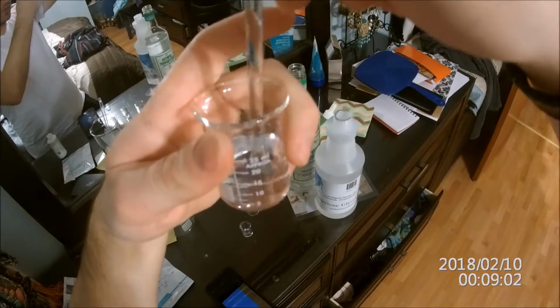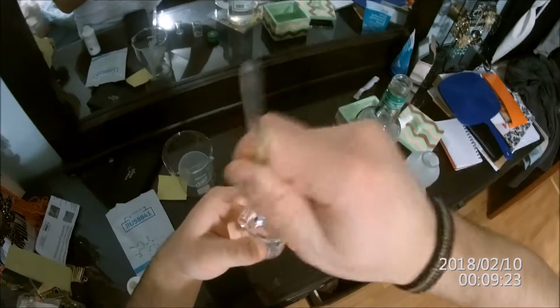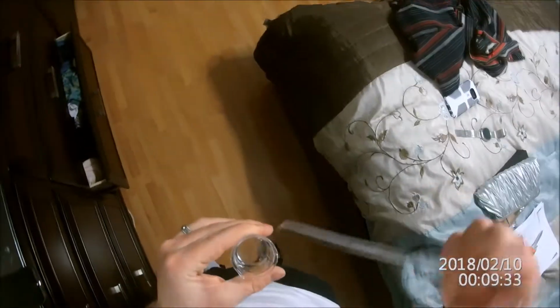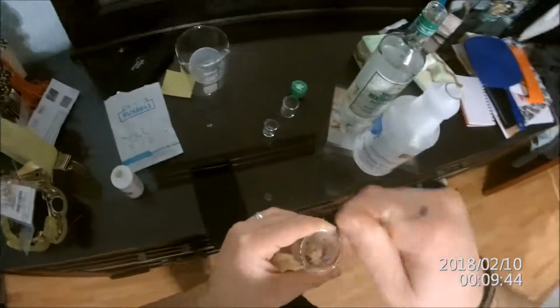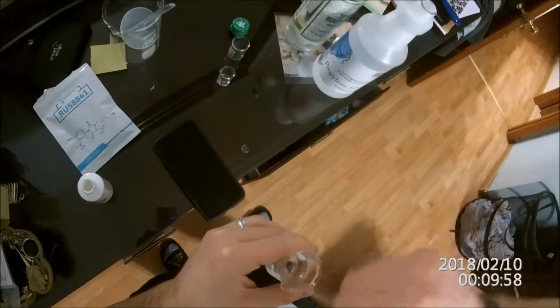So it's almost completely clear. This is the good thing about mixing it in ethanol and propylene glycol. The reason why I think it's better is because it completely dissolves. This thing is almost clear now. There's just very few particles left, and the rest of these particles are just going to dissolve by themselves overnight. With minoxidil, it's much harder to dissolve this. I'm talking double if not triple the time that you need to spend just mixing it, and even then it won't fully mix in my opinion, so that's why I think it's better to mix it in ethanol, propylene glycol.